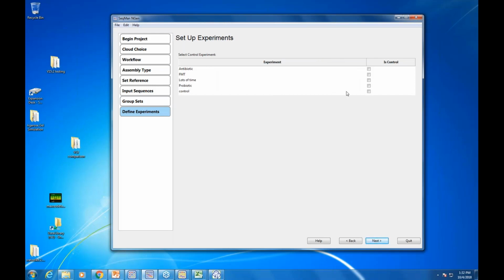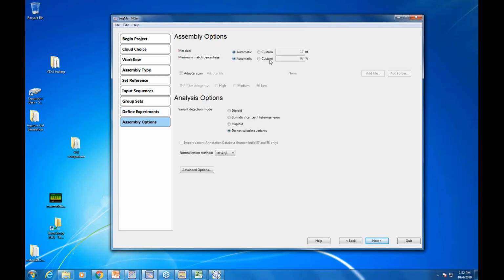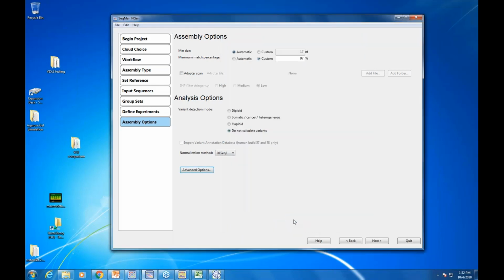And we're going to select a control. And for some comparisons, identifying the control up front will matter. And we can see our match percentage now is lower. So I'm going to set this back to 97. And the important thing to remember is I want this as metagenomic, not an RNA-seq. So I'm going to change this. And by switching that to all, this becomes a metagenomic workflow.